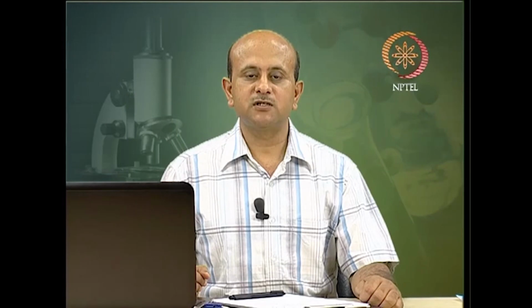In the next section we will start with specific chromatographic methods: ion exchange chromatography, gel filtration or exclusion chromatography, affinity chromatography, and also gas liquid chromatography systems. Thank you.